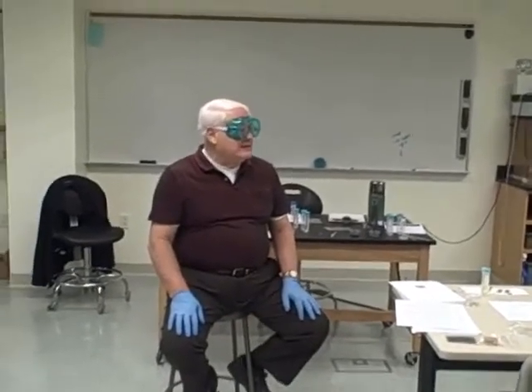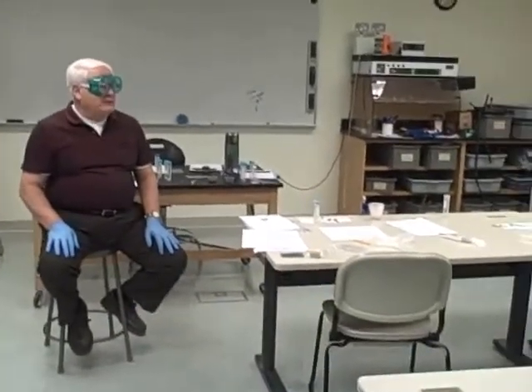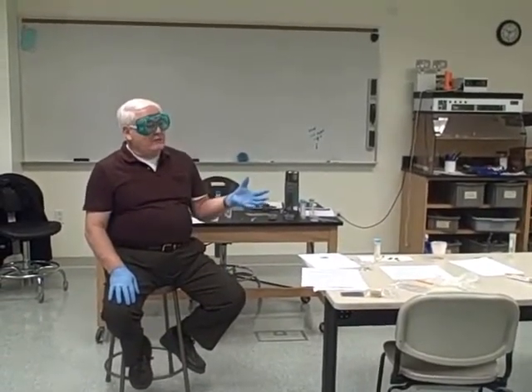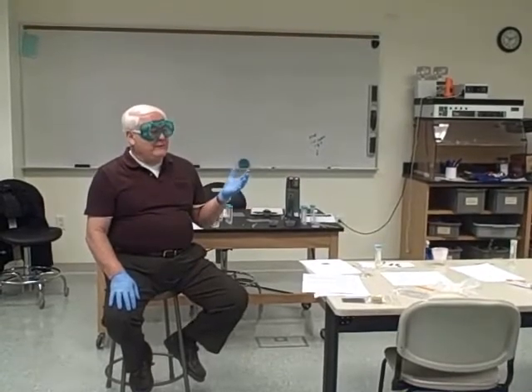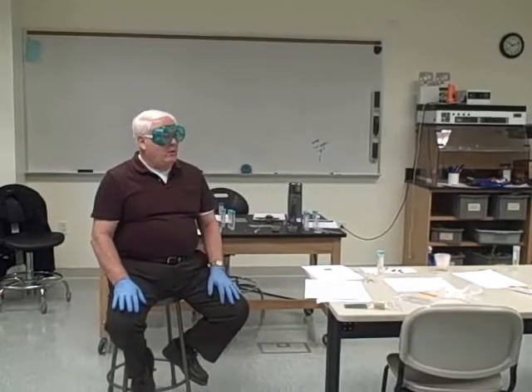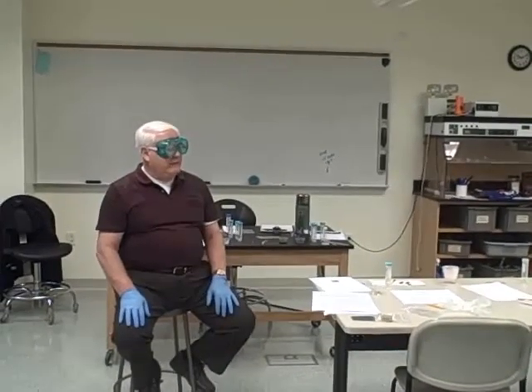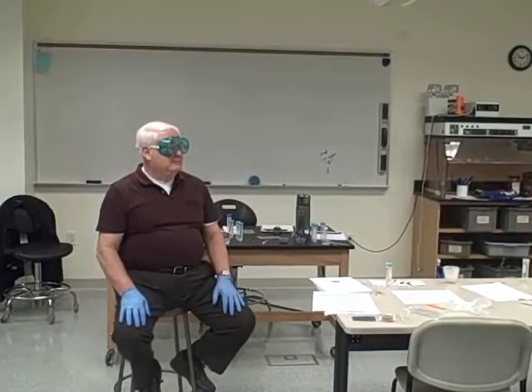Aluminum is more reactive. What we did with this reaction is we used a synthesized copper ore, if you would. We used copper sulfate, which is a synthesized ore, the reverse of the way copper should be found normally in nature. And we used aluminum metal, which is also the reverse of how it should be found in nature. What happened?